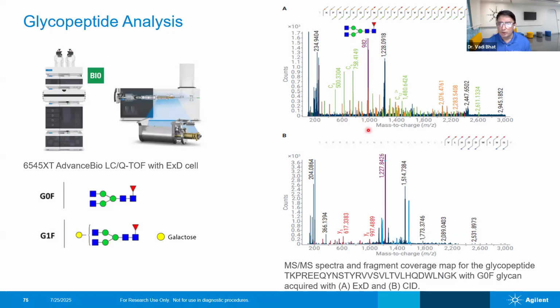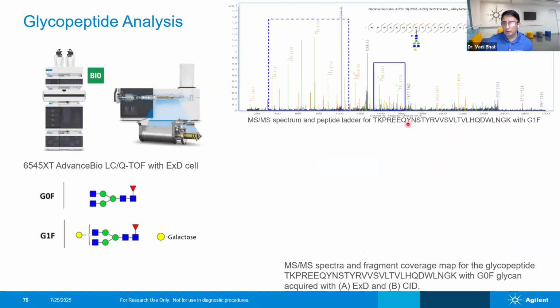In this case, you can see that this particular N amino acid is involved in the modification, right? If you take traditional CID or HCD based fragmentation, your sequence coverage is very minimal. You can get only a partial sequence, and that's the reason people are combining CID, HCD, and ECD or ETD fragmentation, where with ECD fragmentation one can get better fragmentation and better identification.